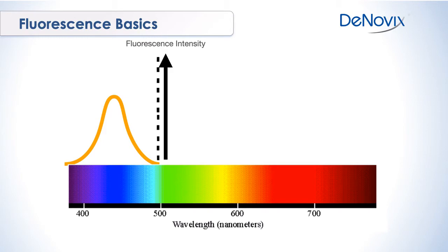So we can use assays that are not perfectly lined up with our hardware or our technology, but we have to accept then that we may have to sacrifice some of the sensitivity of that assay.